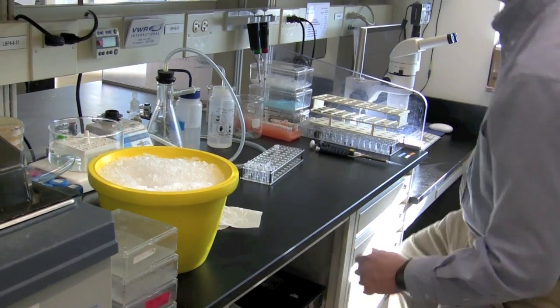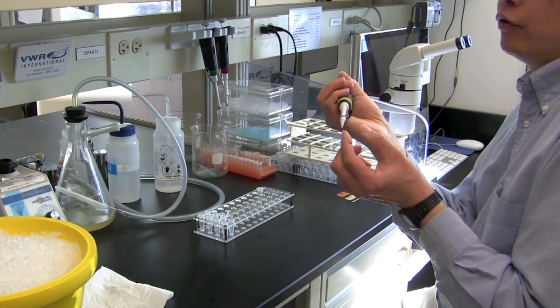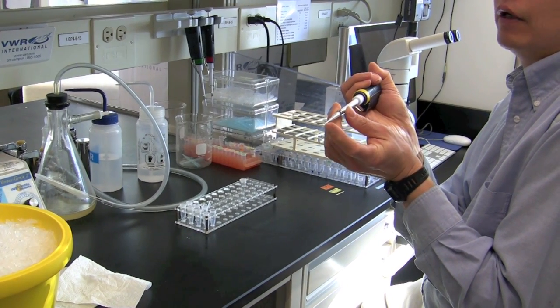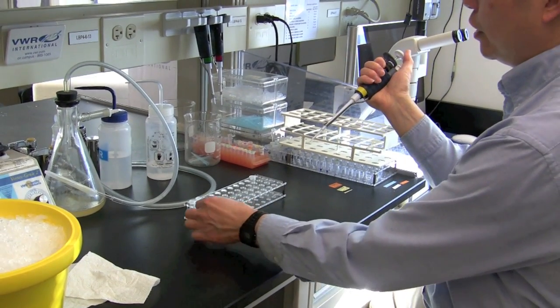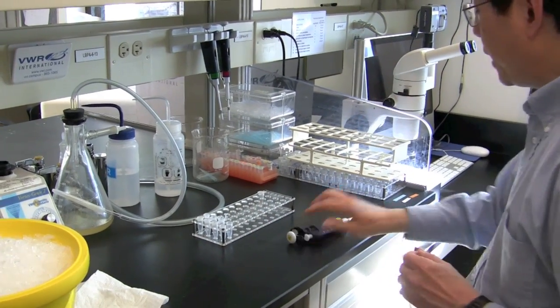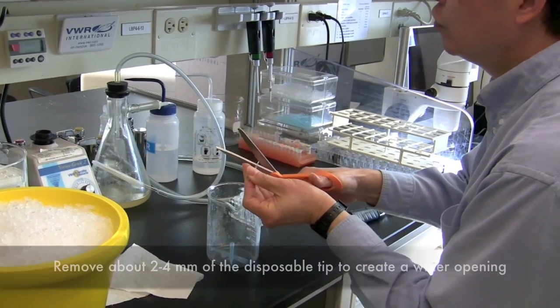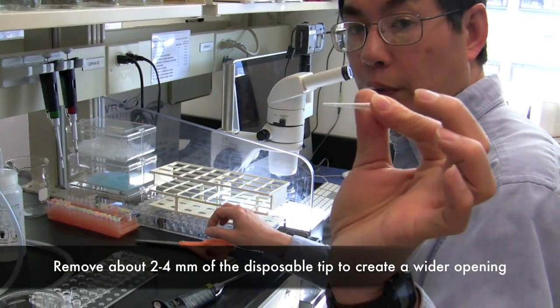Okay, so if I were to simply take a regular P200 with a tip, one of these white tips that we use, it's got a very narrow tip at the bottom, and it's difficult to get the pellet to travel through that small opening. So instead, what I'm going to do is cut off the tip of the white tip. So remove just a little bit. Okay, so you can see now it's got a wider opening compared to before.